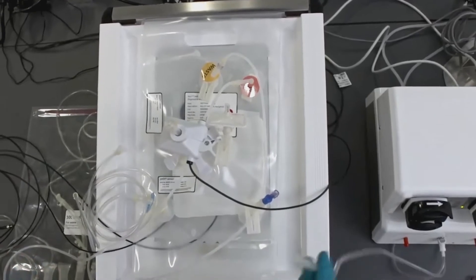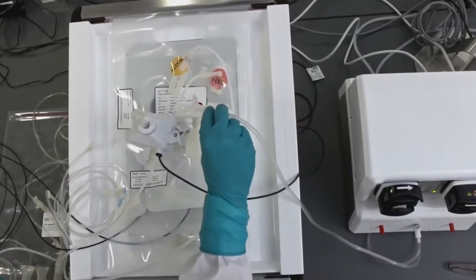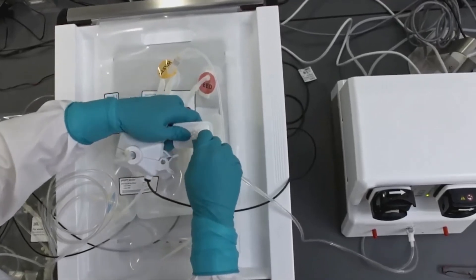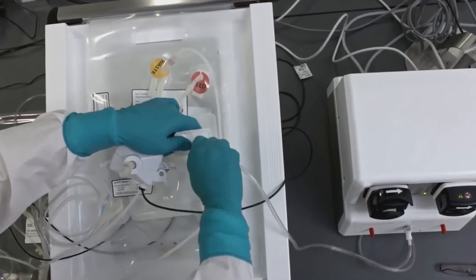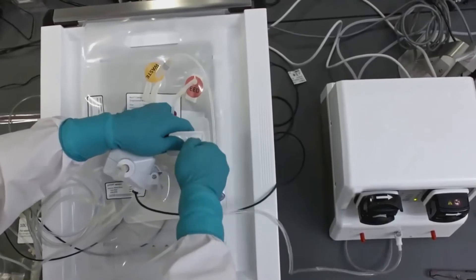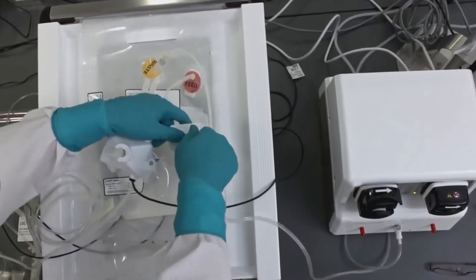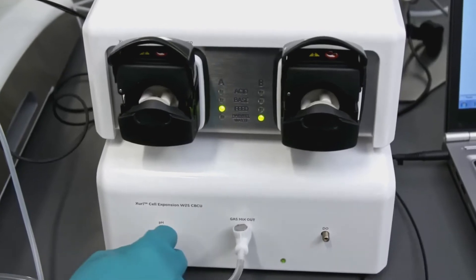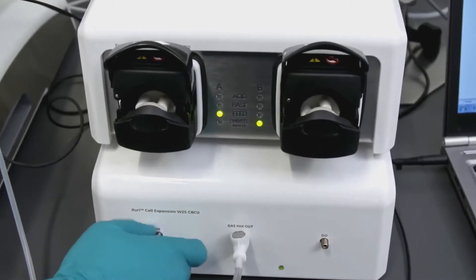You'll then connect your gas mix outline into your air inlet port filter. You'll then connect the pH and DO sensors to the front of the CBCU.